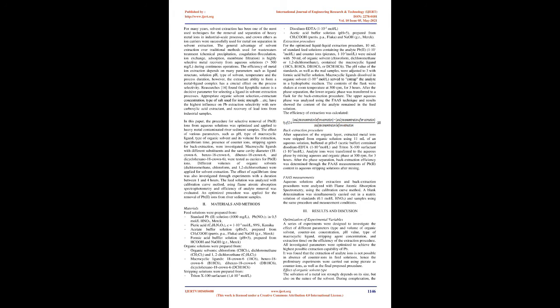For many years, solvent extraction has been one of the most used techniques for the removal and separation of heavy metal ions in industrial scale processes, and crown ethers as ion carriers were successfully used for metal ion separation in solvent extraction. The general advantage of solvent extraction over traditional methods used for wastewater treatment, chemical precipitation, coagulation-flocculation, ion exchange, adsorption, membrane filtration, is highly selective metal recovery from aqueous solutions, 500 mg/L, during continuous operations.